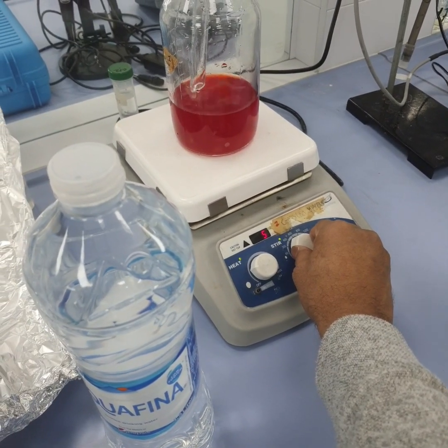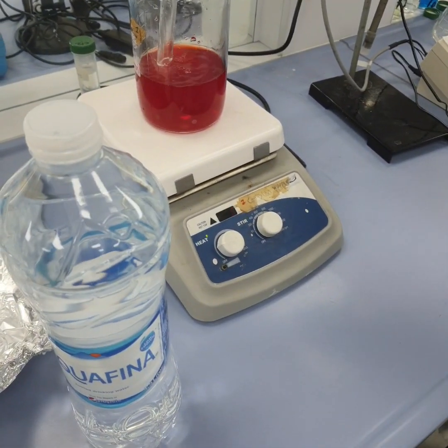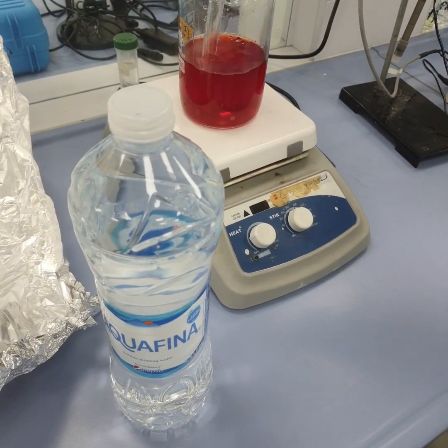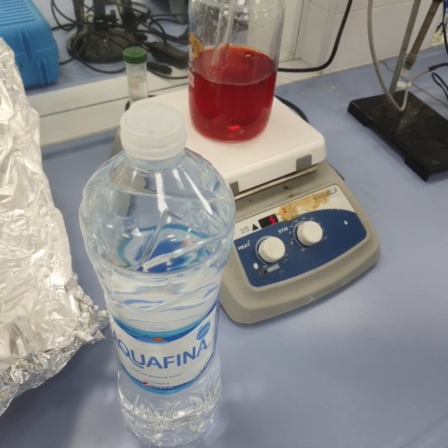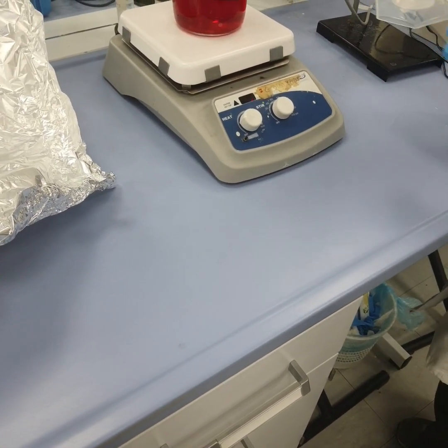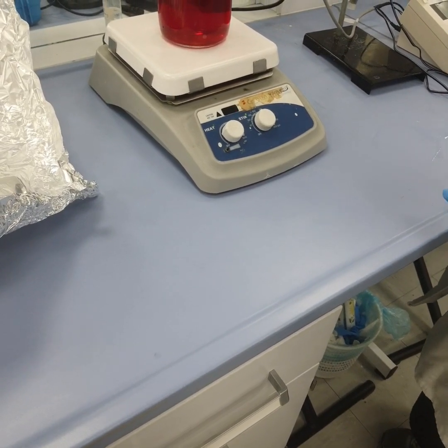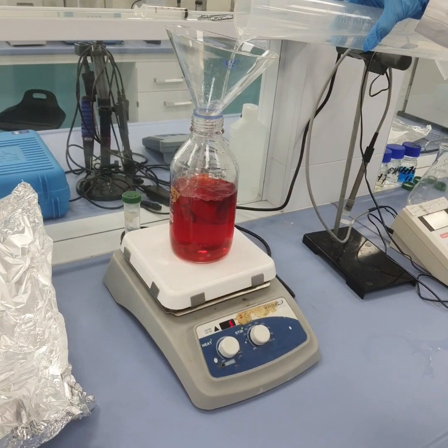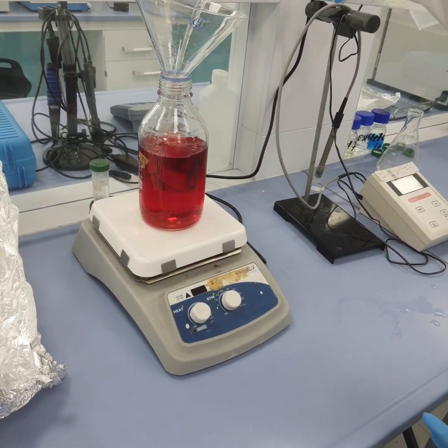Add more, yes, more 500, more 500. So this is around 1 liter.